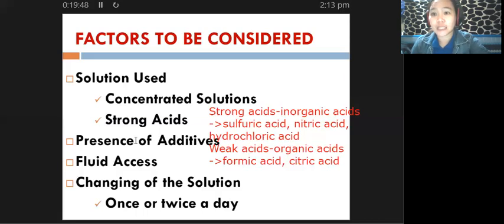I think you also discussed this in clinical chemistry. Of course, if your enzymes undergo denaturation, their activity will be lost. You will not be able to demonstrate the activity of a particular enzyme. So do not use strong acids for immunocytochemical staining, or if you want to demonstrate the activity of your enzymes later.